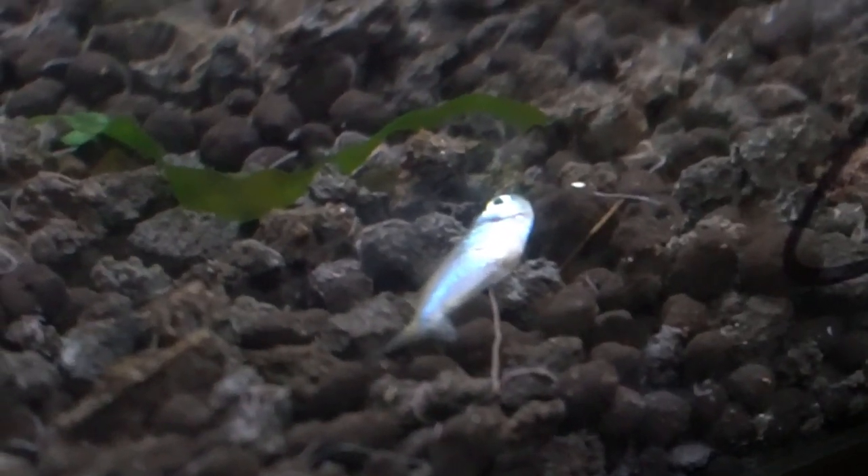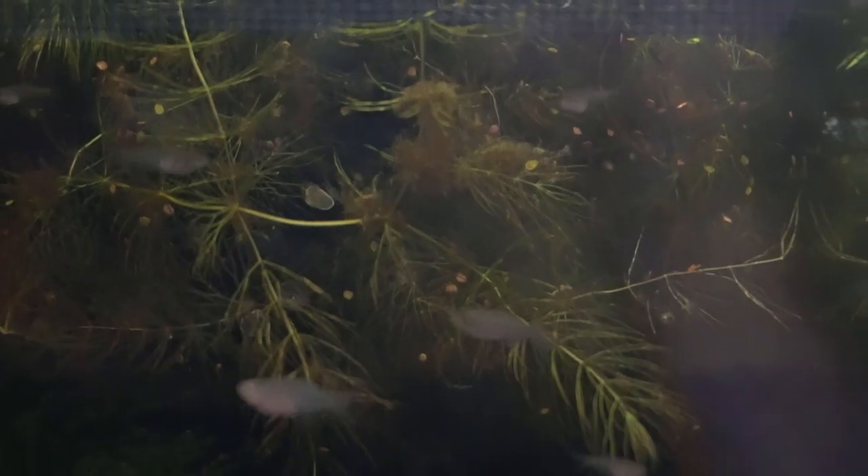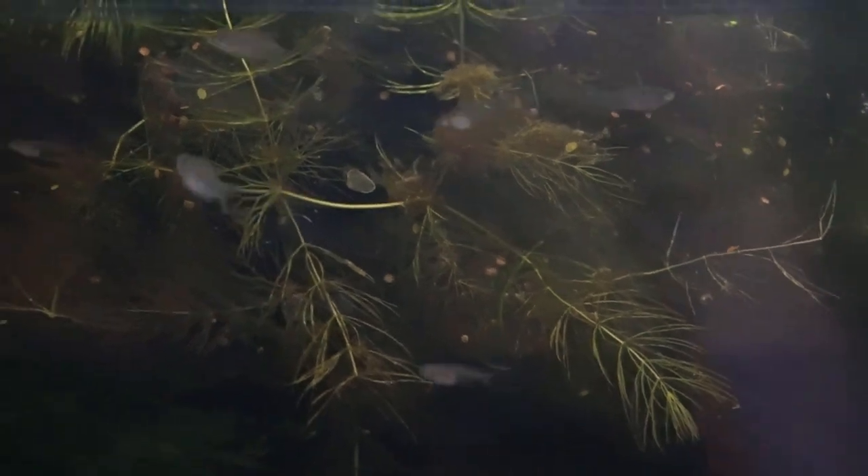It's an older fish — pretty much just old age as far as I know — but there's definitely something on the side of the fish that looks odd. As soon as this fish passes away, I have no other way to euthanize it, so I'm just going to let the fish pass away on its own. There's definitely something weird on one side and I'd like to take a closer look at it under the microscope.